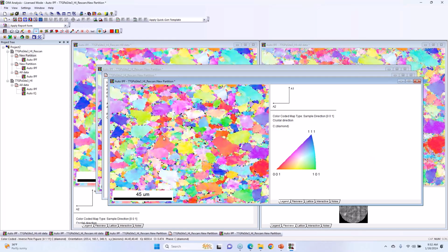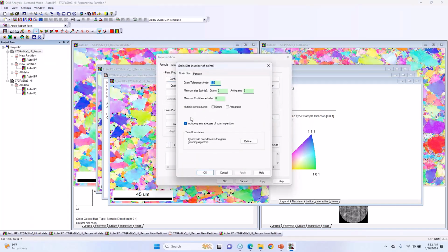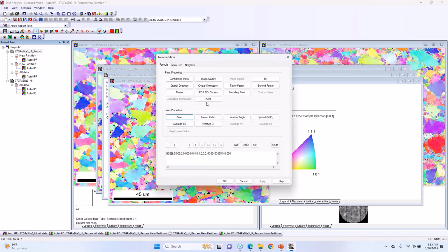And we look at that and then we say, okay, now we can see a few more of the black points here. So for these other black points, I can create another partition where I say I want to look at the grains that are smaller. So I've switched here to partition, gone to smaller. Make sure I did that right.